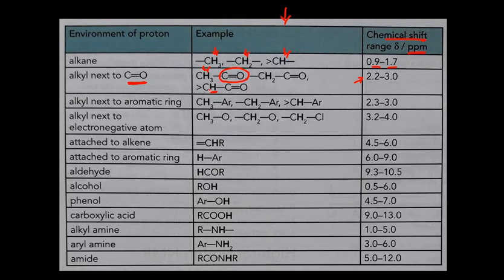In which environment this hydrogen is present, that is, besides the hydrogen, what other atoms, elements or groups are present, will decide the chemical shift of the bolded hydrogen, and it will show you the range at which the peak will be produced. So the video can be paused and studied, but we will go ahead with examples.